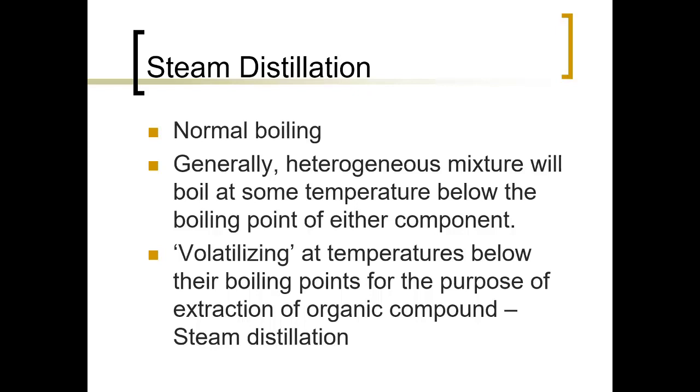And you're going to get a heterogeneous mixture when they boil off together. Heterogeneous means that it's clear that they're not perfectly mixed, and your water is going to then look cloudy. And as your compound comes off, given enough time, they'll eventually separate from each other and you'll see an oil and then you'll see water.